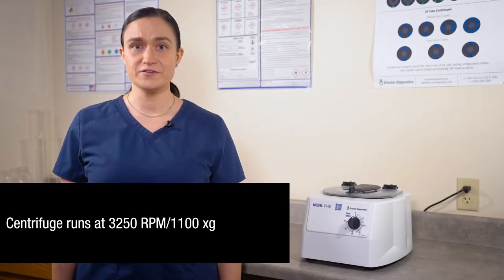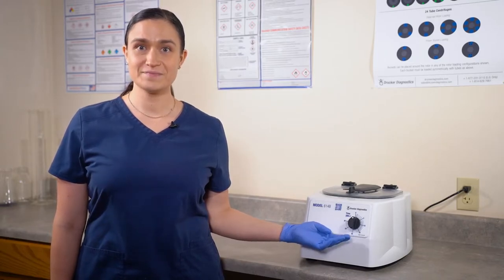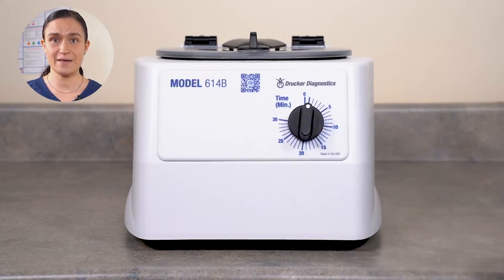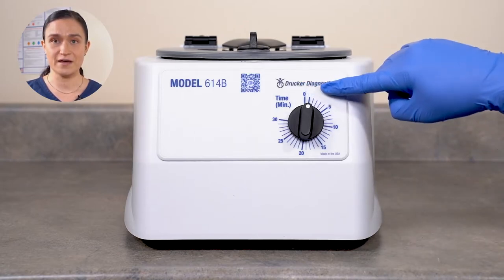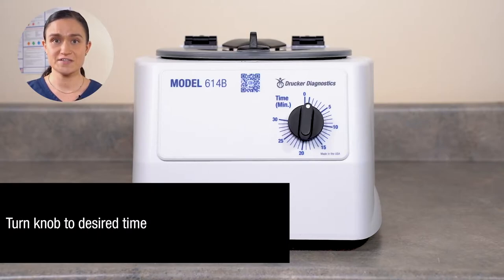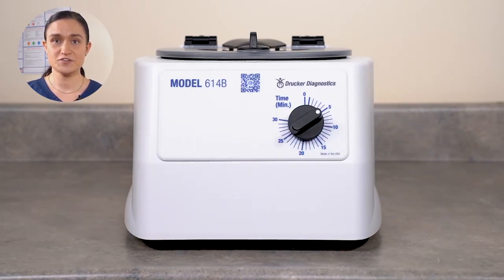Now that we have our 614B set up, we can look at our controls. Part 3 – Controls Overview. Your 614B runs at a speed of 3250 RPM or 1100 XG. Your time is adjustable. Today we're going to learn how to adjust that time and how that time adjustment operates your centrifuge. Your 614B has all of its controls right here on the front panel. The knob here controls the time — it's also the centrifuge's on switch. The numbers around the timer knob indicate minutes of spin. To start the 614B, simply turn the dial to the number of minutes you want to spin. The centrifuge will start automatically.